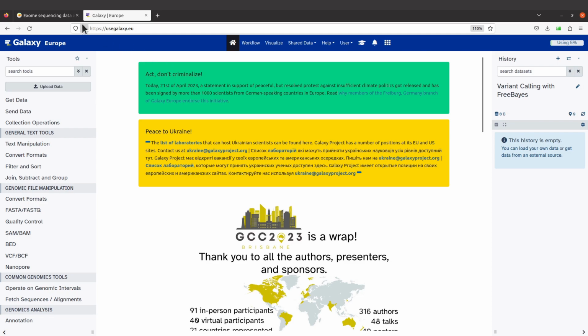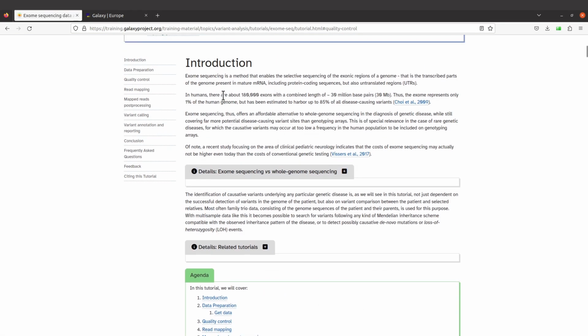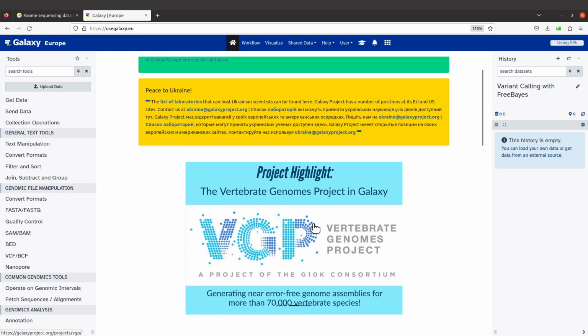So that's it done. Now, if you're a beginner, I will also encourage you to read the introduction because it's very, very important. It helps you to know the reasons why some of these things are done. So if you're a beginner in bioinformatics, it's important to read the introduction and then get an overview of what has been done. All right, so just make sure to do that. Now let's continue.